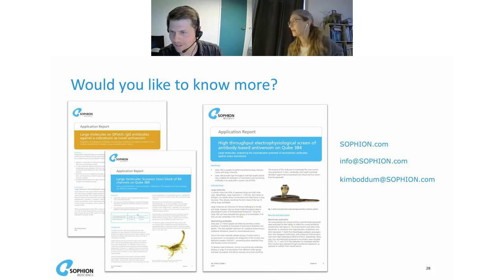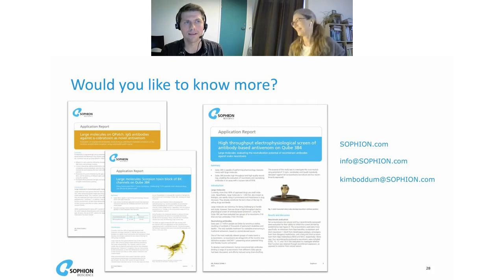The question is, for recording Kv1.3, why is a longer protocol, more than 300 milliseconds, not used for full deactivation? So did you get that one? Yeah, I think for full deactivation, you could do that. We only looked at the peak current, so it wasn't necessary.